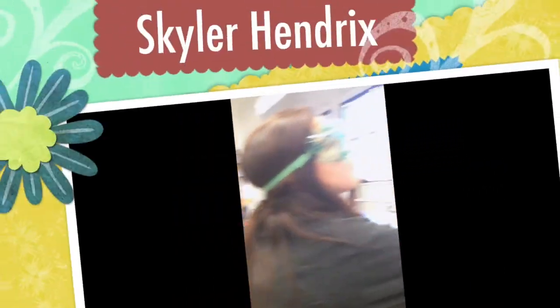So today we're doing a titration, which is used to find the concentration of an unknown. We're starting at 0 milliliters, and you'll notice that there's a meniscus. So you have to read the line at the bottom of the solution. So we're going to start by releasing 1 milliliter.